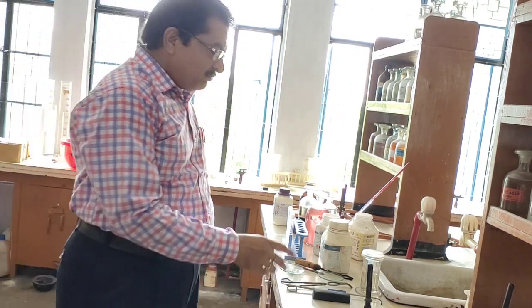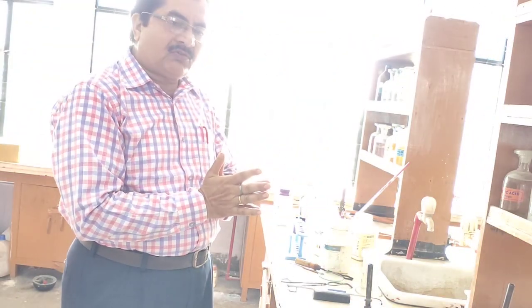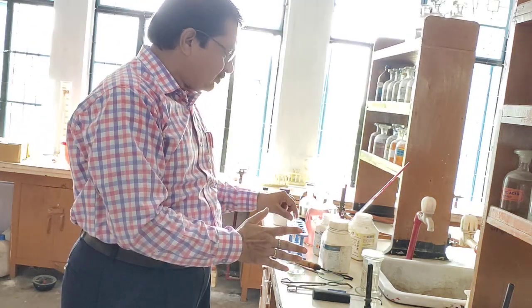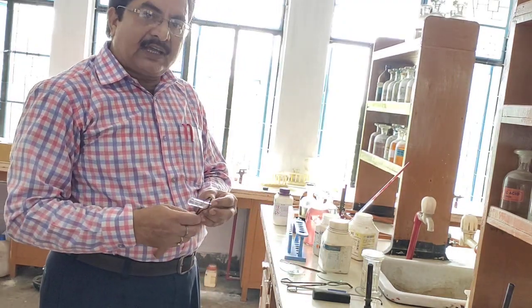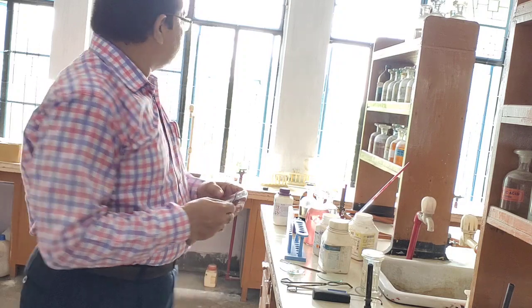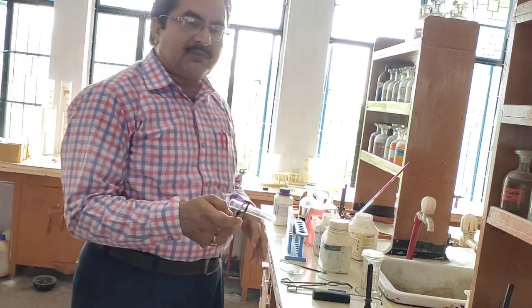So in this way, what we have seen in the action of heat is that first we take a small amount of salt in a well washed dry test tube, and this test tube we put in a test tube holder. Then we check the observation.